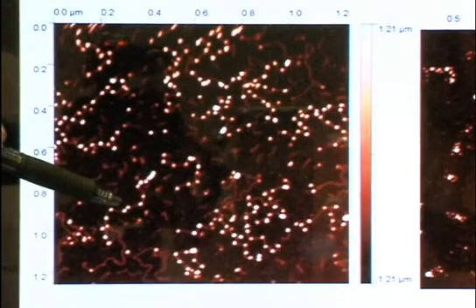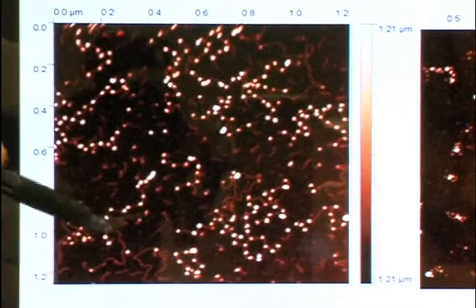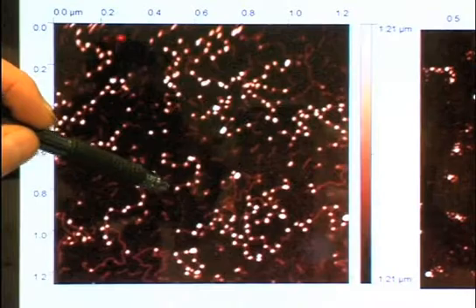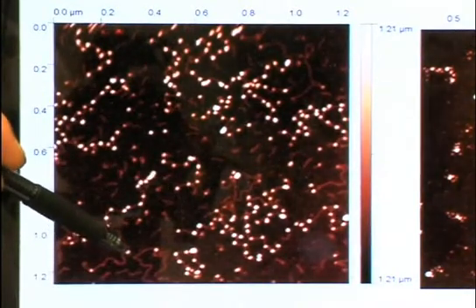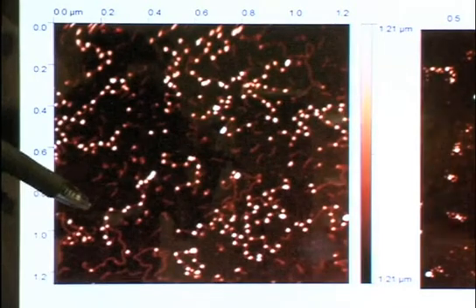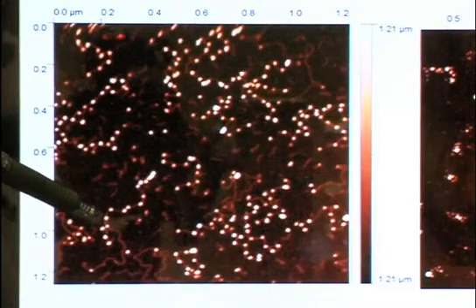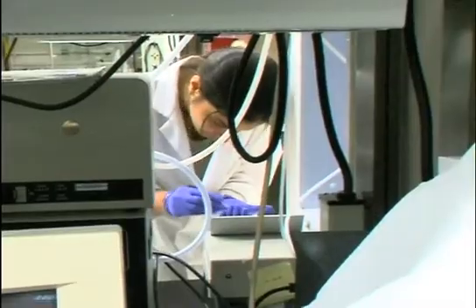So what are we looking at here, Stuart? We're looking at an atomic force microscope image of chromatin spread out over a flat surface. And chromatin's a combination of bare DNA carrying the genetic code, and DNA is this little piece of spaghetti that you see along here, with a group of proteins called histone proteins that wrap it up into nucleosomes, and these are the little white blobs you see along here.